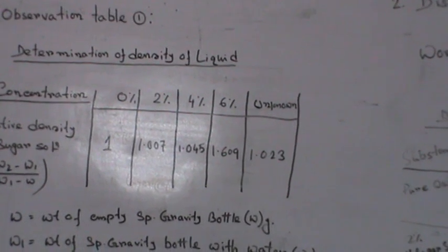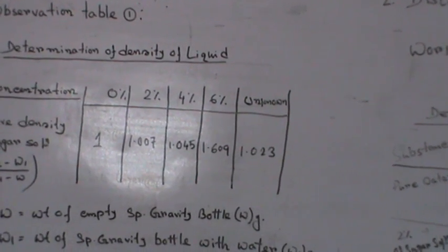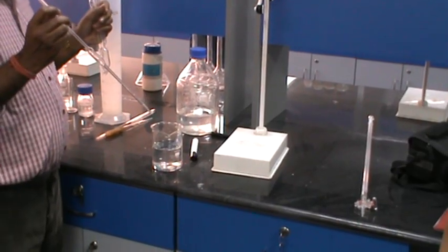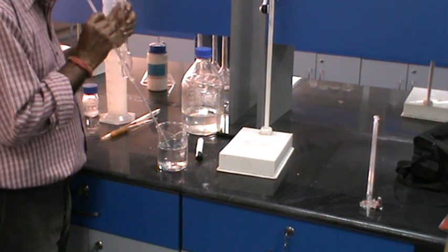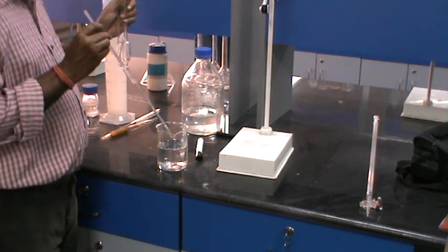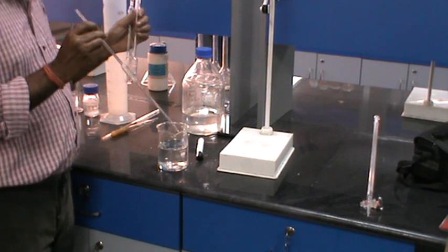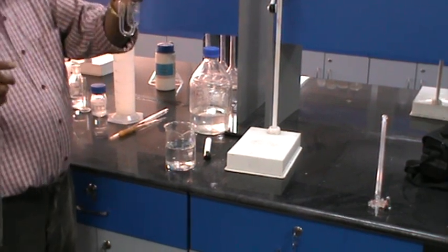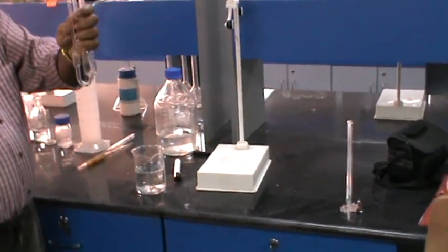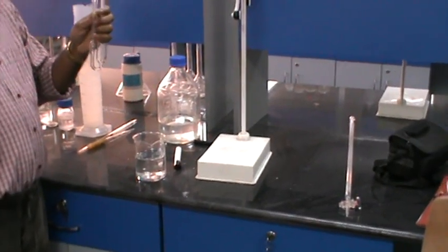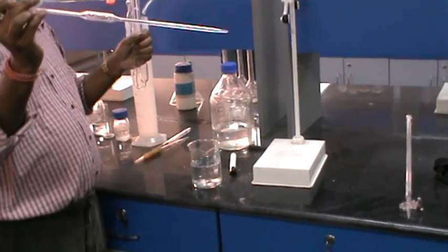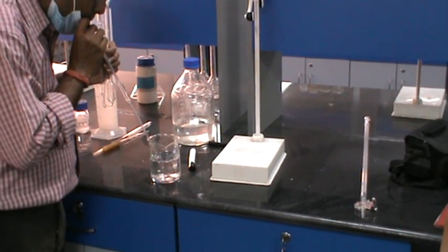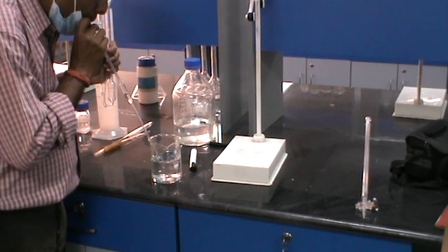We will first show you the experiment with water using the Oswald viscometer, then repeat it for the other glucose solutions. On the left-hand side is the Oswald viscometer, and on the right-hand side is a graduated pipette. We will use the pipette to take water from the beaker and put it into the Oswald viscometer.